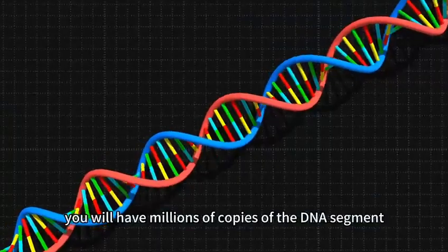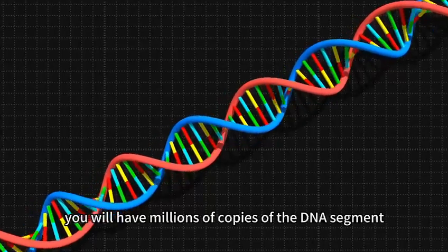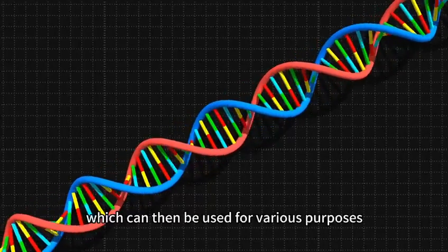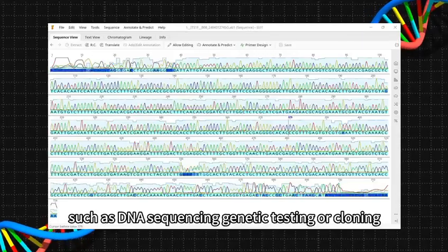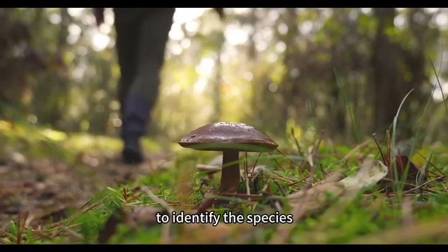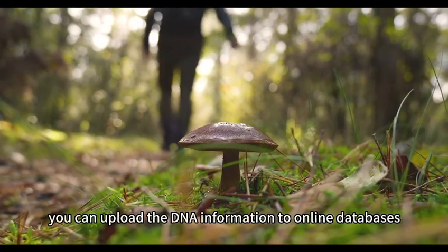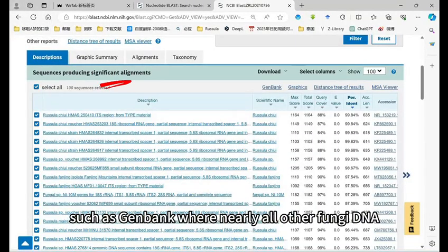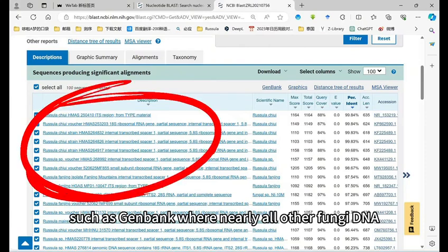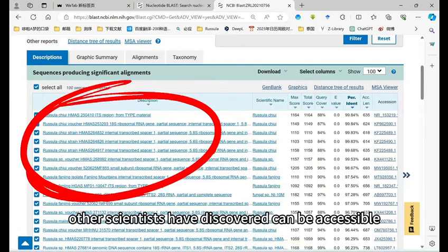You will have millions of copies of the DNA segment, which can then be used for various purposes, such as DNA sequencing, genetic testing, or cloning. To identify the species, you can upload the DNA information to online databases, such as GenBank, where nearly all other fungi DNA other scientists have discovered can be accessed.